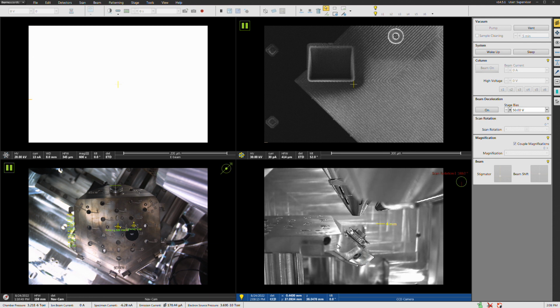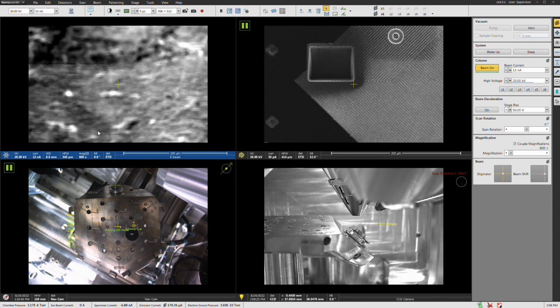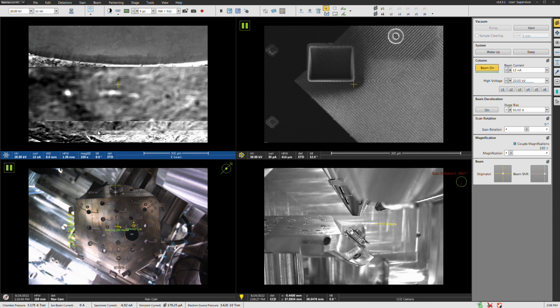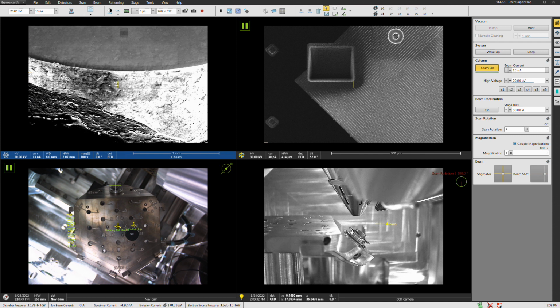That being said, I'm going to stop it well below 4 because we have to tweak with this here. That being said, when the installation is done, it should be configured to operate effectively over a range of working distances. So it doesn't have to be perfectly at 8 millimeters in order to work. That should be something that is accounted for in the installation. But we are going to target 8 millimeters here today.